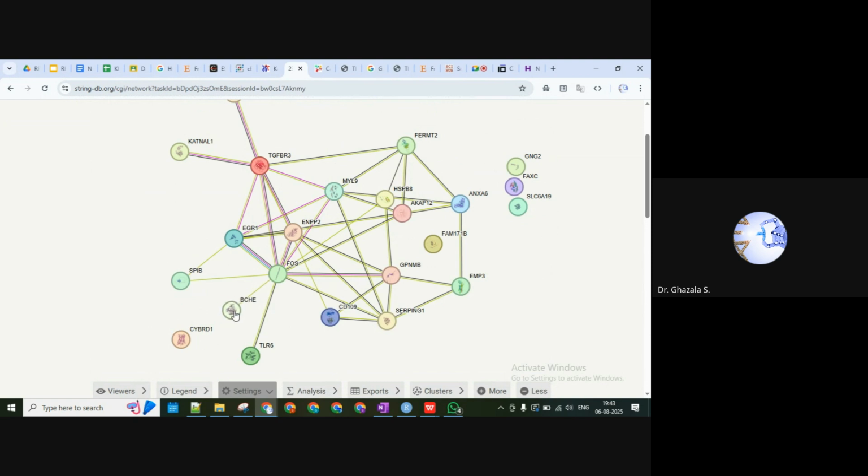Maybe they are in no way interacting. Okay, so without delaying or taking more time unnecessarily, we will focus on the other genes which can be related. Like we can see now in our network, other genes are all connected except the 4 genes that we have here. So we will focus on the other genes.